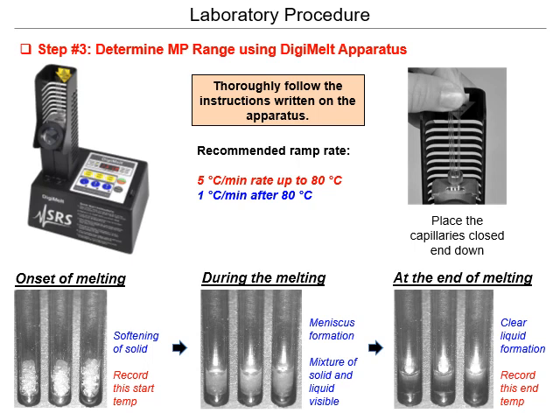As the middle progresses a little bit, it's definitely melting, but there's still some solid in it. And then finally at the right, everything's melted, and that would be your end recording temperature. So your temperature range would be from when you first started seeing the melt, which would look like the bottom left, to the final melt when everything is melted on the bottom right.